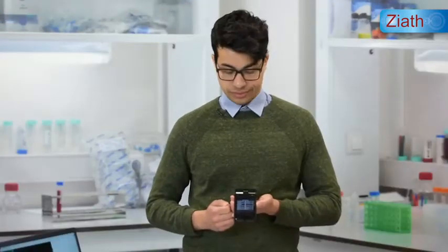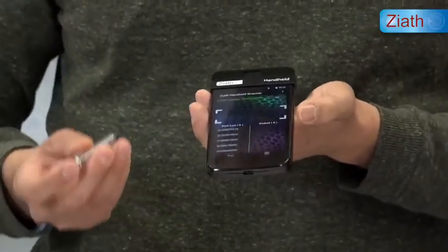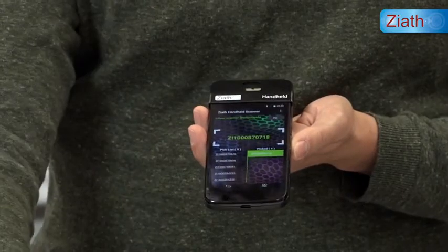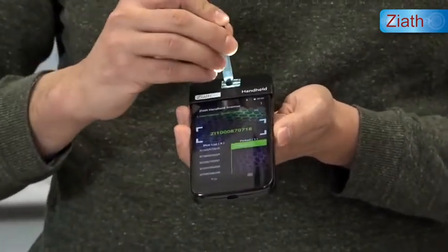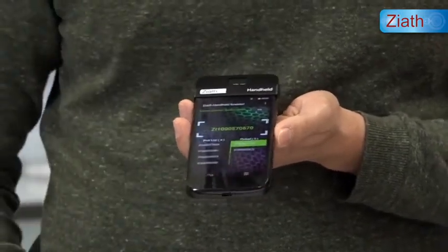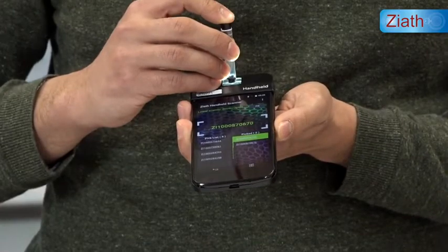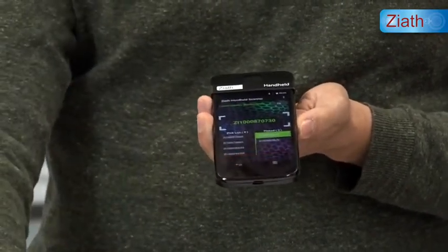tube on shelf 2. We can now scan a tube by clicking the light up function button first. The tube will scan and move from the left-hand side to the right to show that it's been picked. If I do the same again for a second tube, it will also move that tube to show that it's been picked. If a tube is not contained in the list that needs to be collected, it will show you an error on screen informing you that tube was not contained in the pick list.